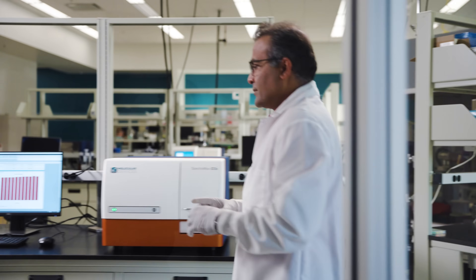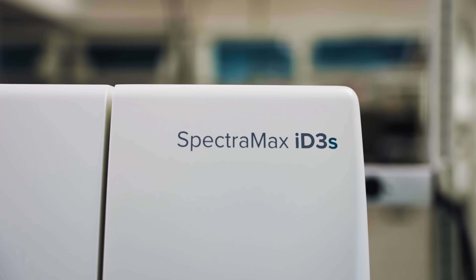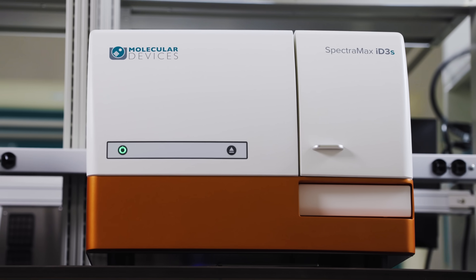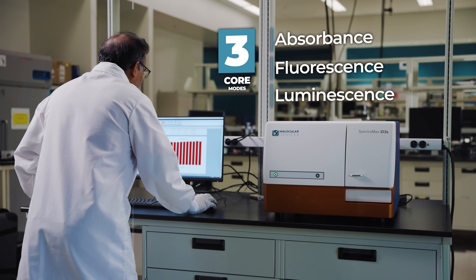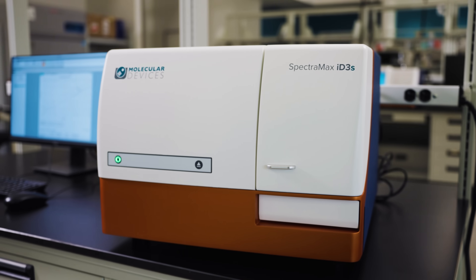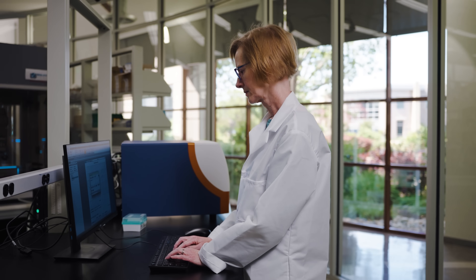For labs seeking simplicity and value without compromising performance, the SpectraMax ID3S Reader is your streamlined solution. With three core read modes — absorbance, fluorescence, and luminescence — this reader offers high sensitivity through a monochromator-based optical system and an ultra-cooled photomultiplier tube.